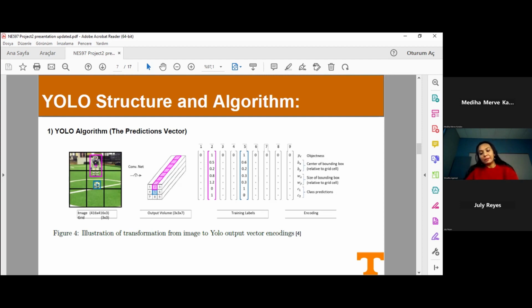First of all, you give it an objectness score, and some grids have no objectness score because there is no center of an object. It checks the class probabilities, what kind of object is there, and then it tries to create and predict the bounding box depending upon the class of the object. And then it predicts a bounding box, right?